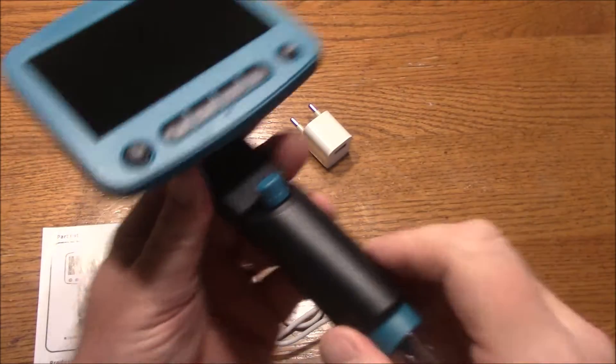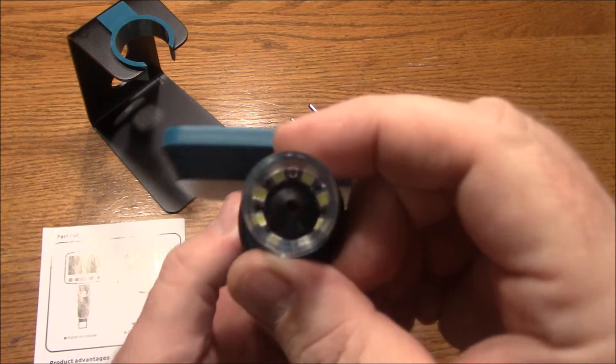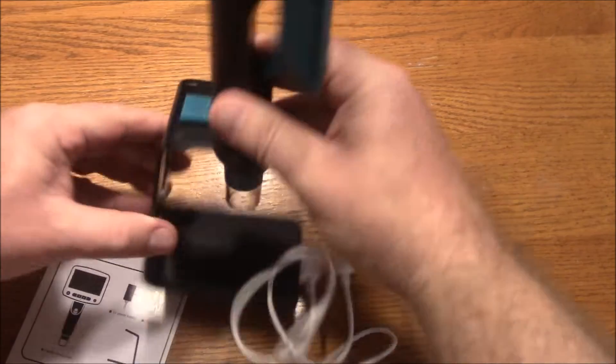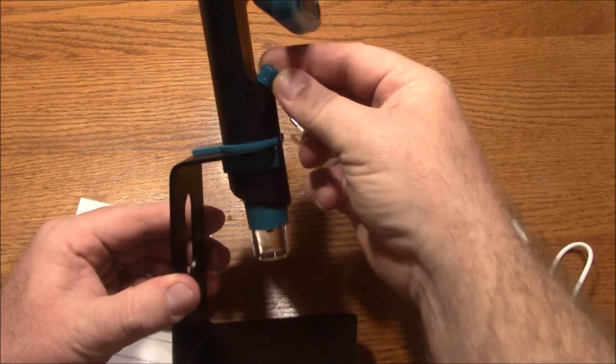This is what the screen looks like. Here is the adjuster for the focus, and then down here on the bottom it has LEDs inside there and the camera itself. It just sits up on this little stand, and that's how it works. You can adjust it with this once it's turned on.